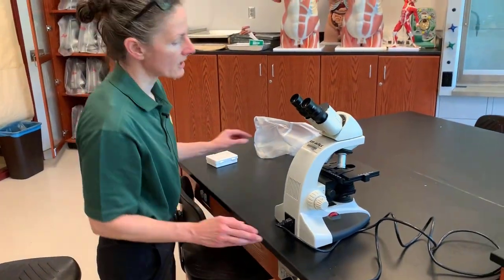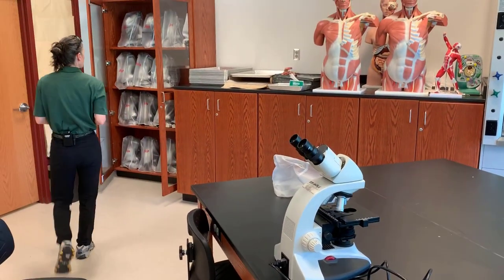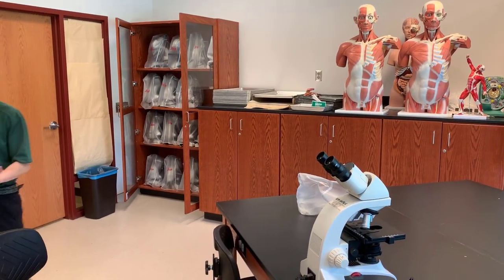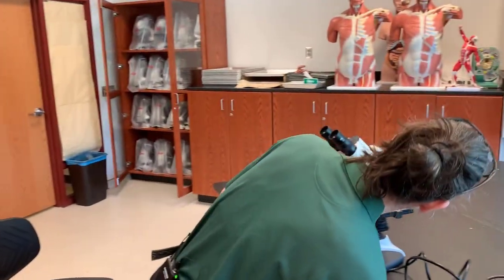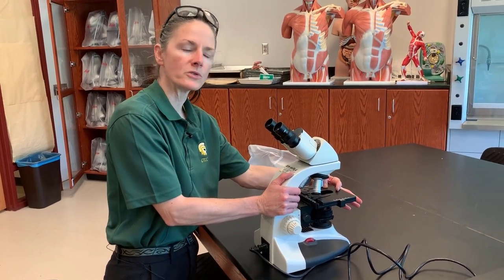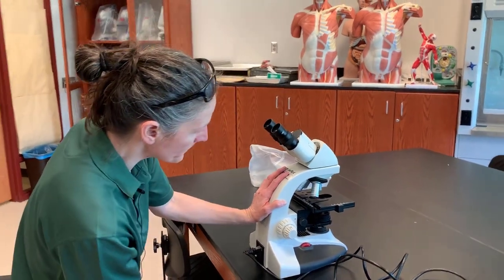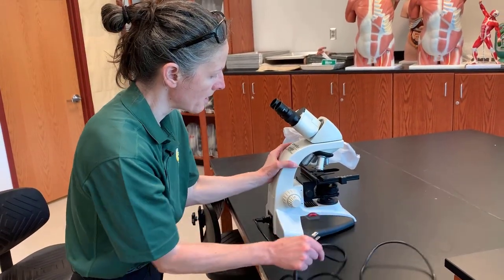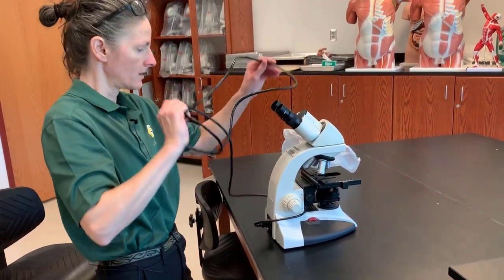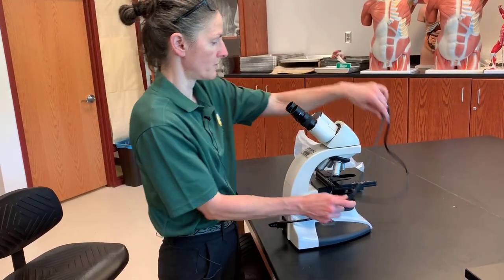We always leave the scanning objective in place when we store the microscope. If your previous lab has done everything correctly and left the microscope in the last state that they used it, then technically when you put your slide on, it should be almost in focus with very little adjustment needing to be made. When you put your microscope back, you will want to wrap the cord around the arm of the microscope so that you don't trip over it.